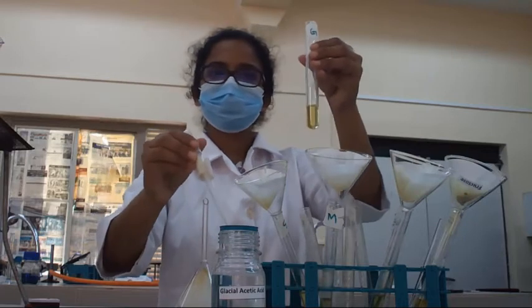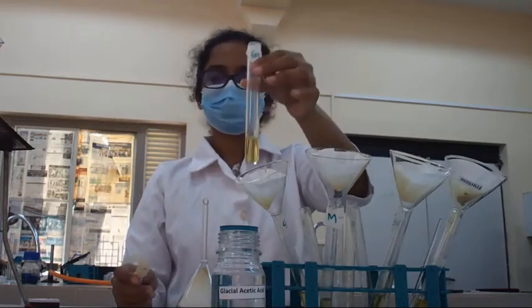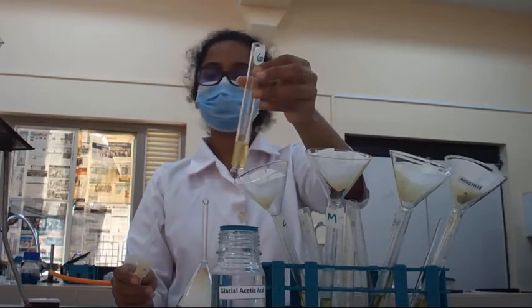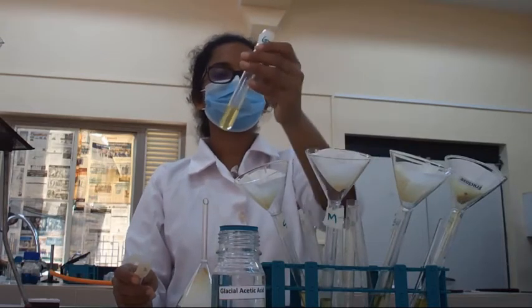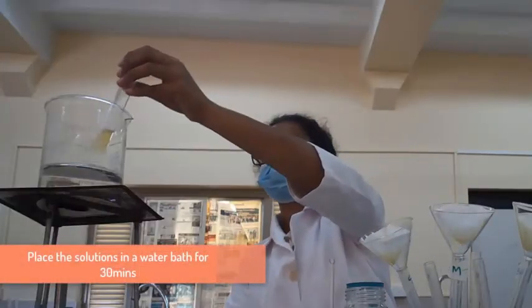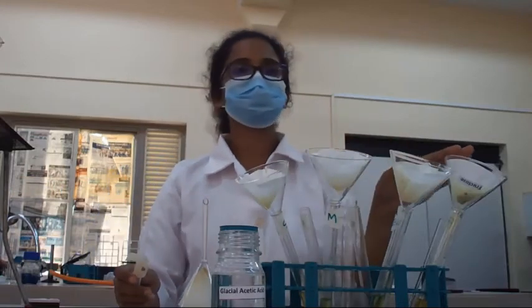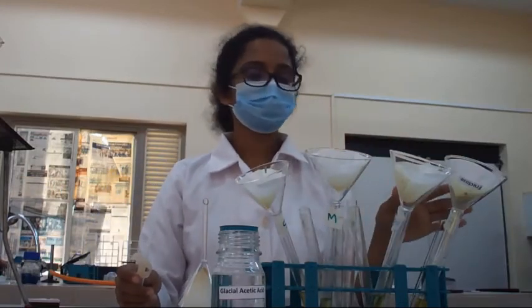After addition of glacial acetic acid, we are going to place these samples in the water bath for about half an hour. We are going to practice this procedure for all of these samples.